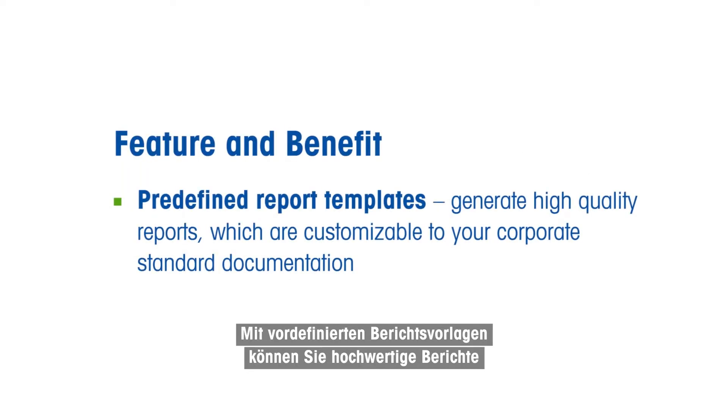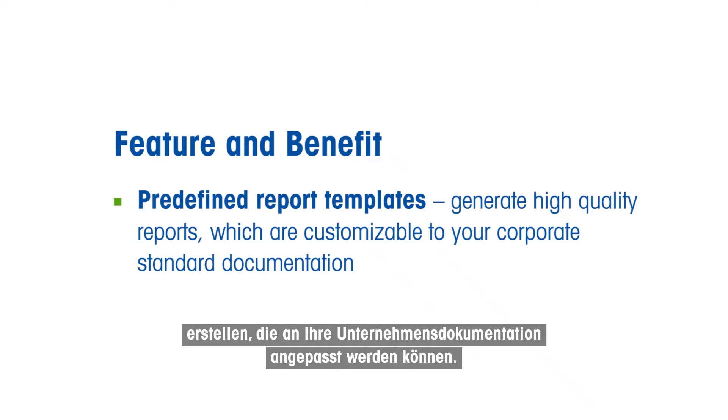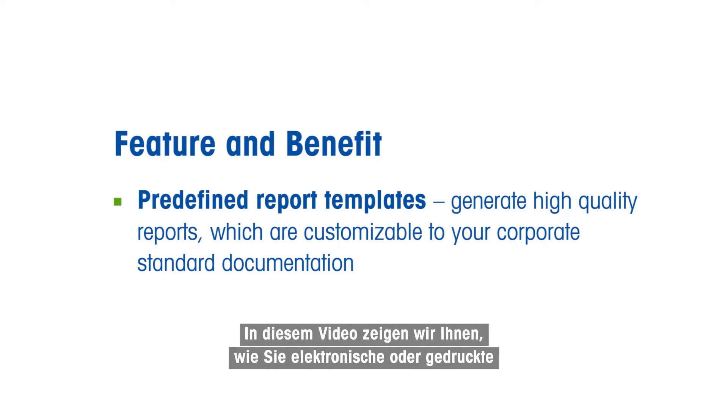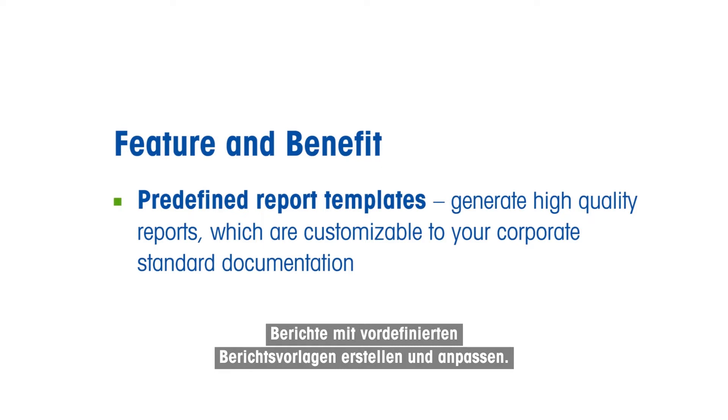Predefined report templates allow you to generate high-quality reports, which are customizable to your corporate standard documentation. In this video, we show you how to generate and customize electronic or printed reports using predefined report templates.